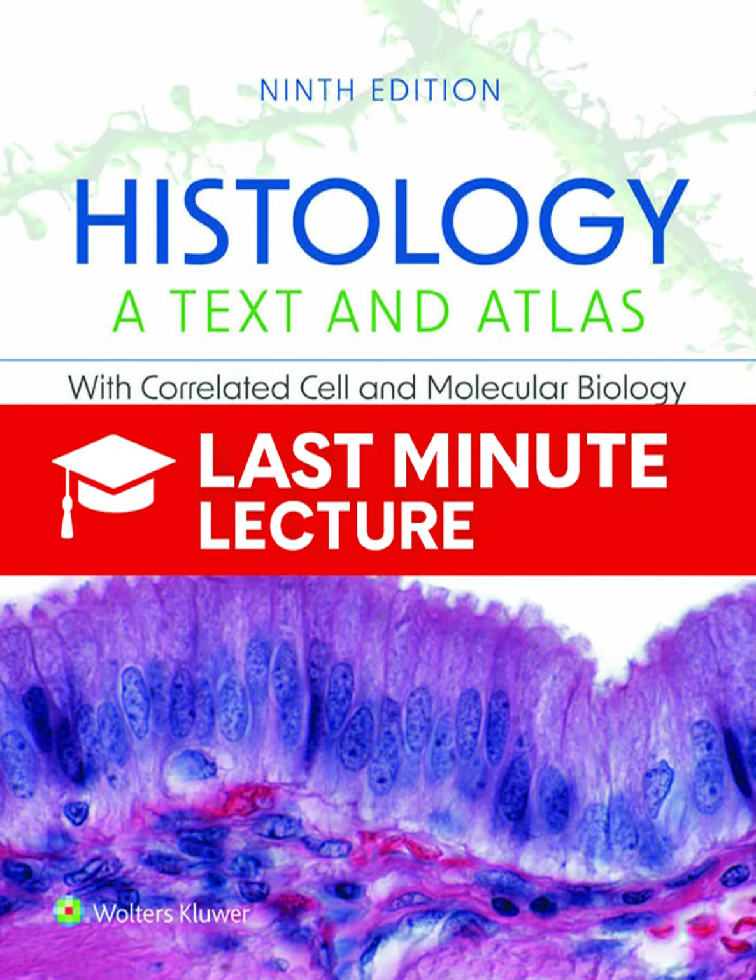Let's break down the steps, which are outlined in Figure 1.9. It uses those super absorbent materials, hydrogels. That's right. The tissue gets infiltrated with monomers of a hydrogel, a swellable polymer, like sodium polyacrylate. There are 4 major steps before you get to the actual expansion. What are those prep steps? First is anchoring. The proteins you're interested in, which are usually fluorescently labeled, get chemically linked or anchored to the monomer molecules that are going to form this polymer web.